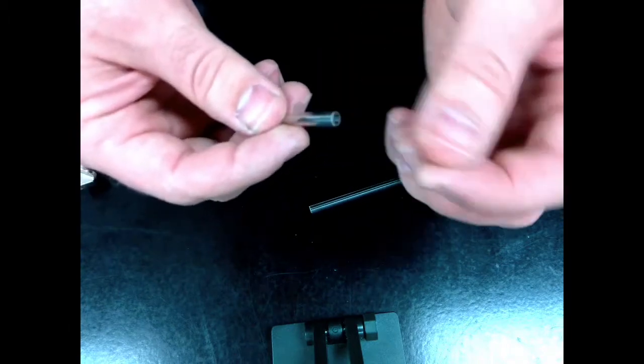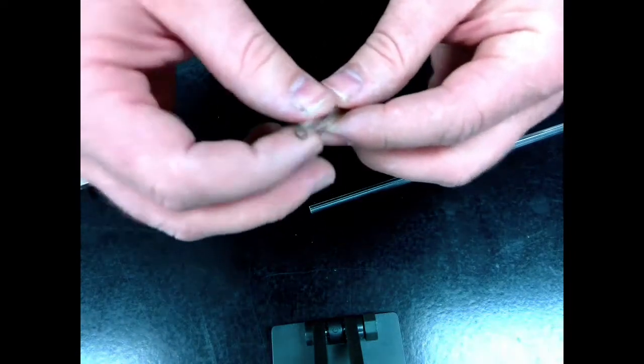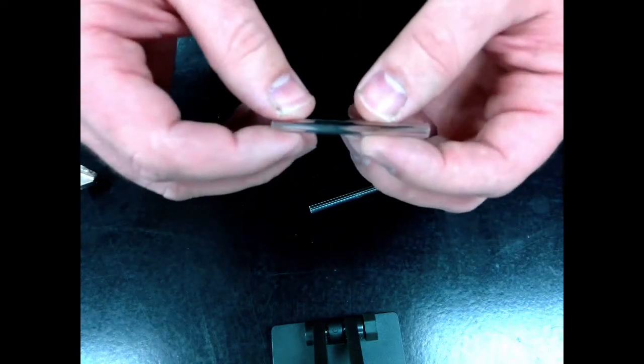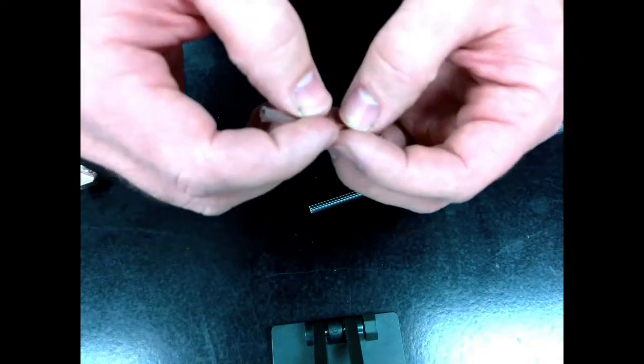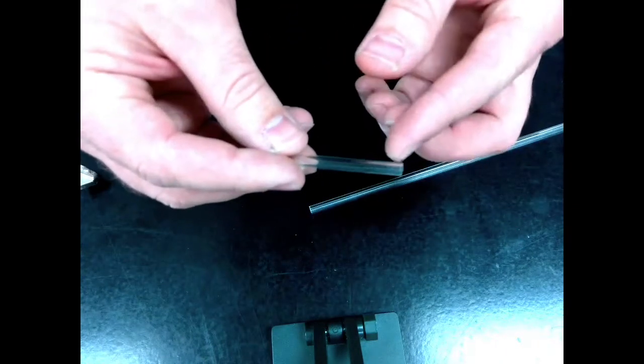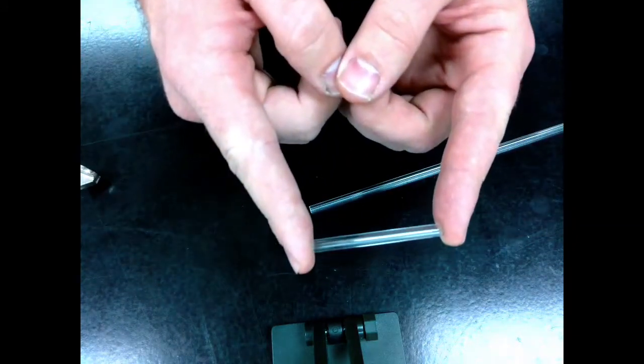It's still sharp, and it's still not going to be fit for using in a lab because these sharper edges will catch on rubber stoppers. And if they catch on rubber stoppers, they won't go through. I won't be able to pull it out. And when I try to push it in, it'll probably break, and I could damage something and hurt my hand, potentially. So we need to be able to smooth out these edges, and we need to be able to put a bend in this. So next I'm going to show you how to bend this.